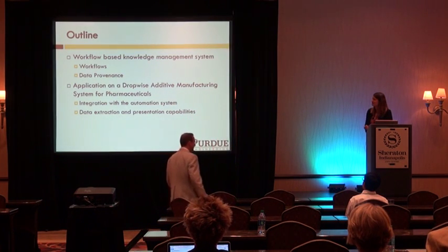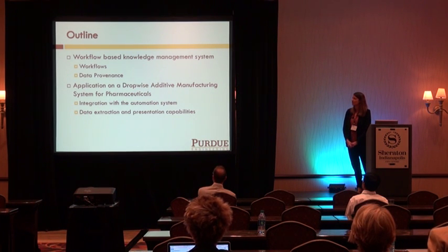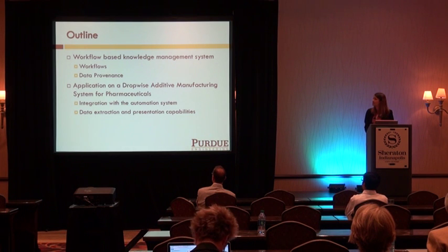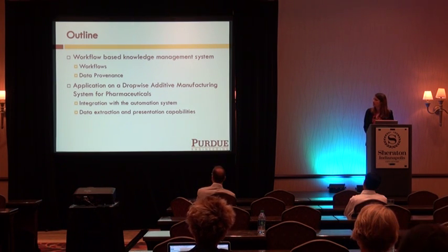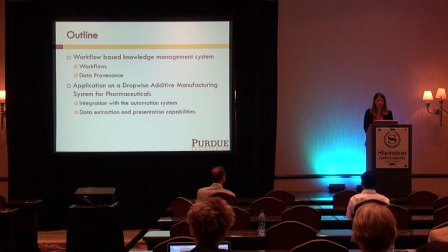So here's my outline. First, I will give some details about the workflow-based knowledge management system we developed with HUBzero as a HUBzero component. And I will talk about the workflows and data provenance. And then I will explain how we use the KMS system with the Dropwise additive manufacturing system for pharmaceuticals, and how we integrated the KMS with the automation system, and how we use that for data extraction and presentation capabilities.